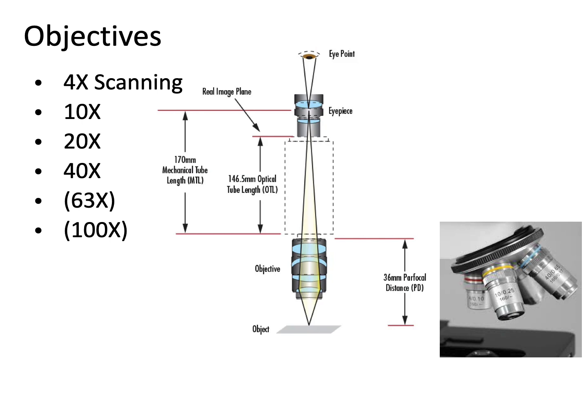So when we're thinking about total magnification, if you're using that 4 times objective, that's fine. But if you're looking through the microscope, there's also the 10 times ocular, which doesn't change no matter what objective you're using, right? So the real, realized magnification there is 40 times. I have these lower objectives, 63 and 100, because sometimes they're on standard teaching microscopes, for sure in research grade.